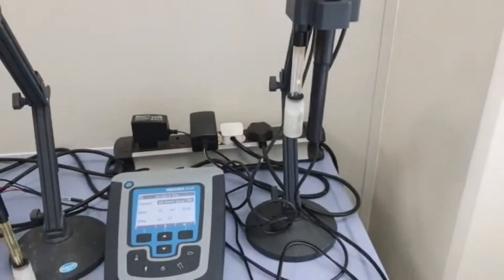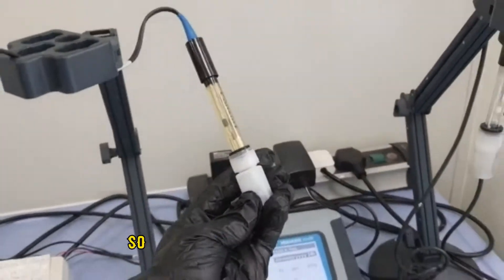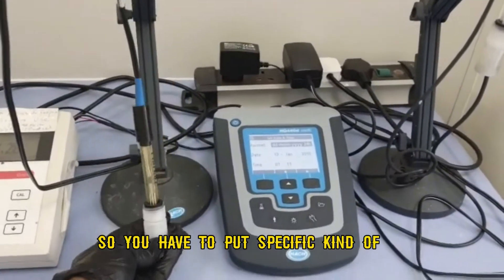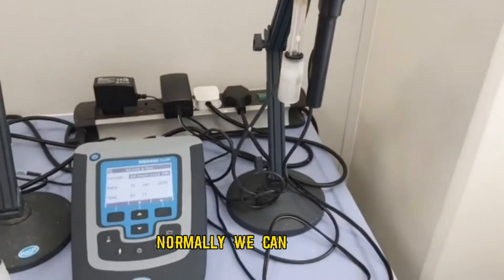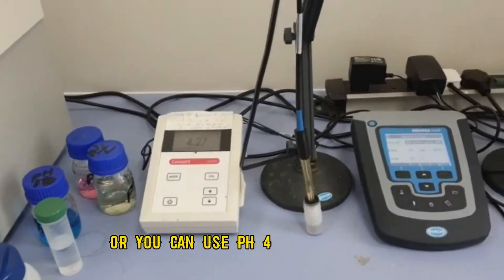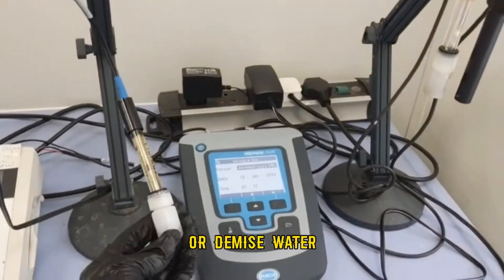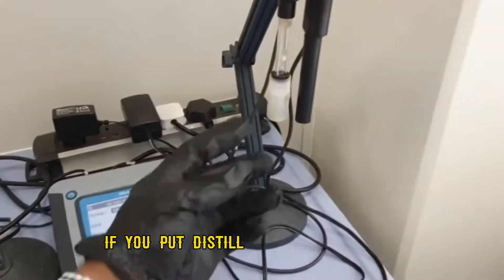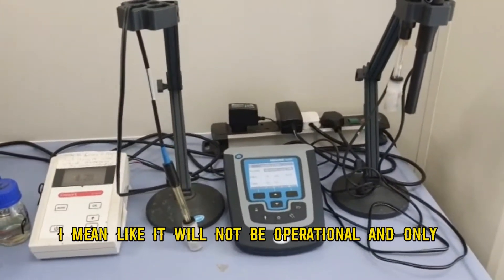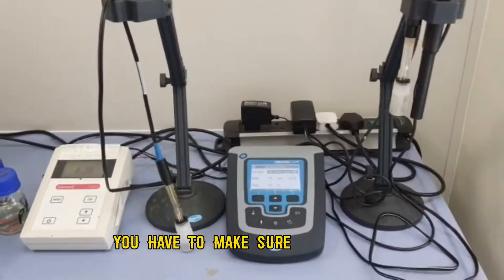Normally in pH meters we have to put a certain kind of solution — you cannot put just any acid or base. You have to put specific solutions, such as an electrolyte, pH 4, or pH 7 buffer. You should not put distilled water or deionized water, because if you do, the probe will not be operational.